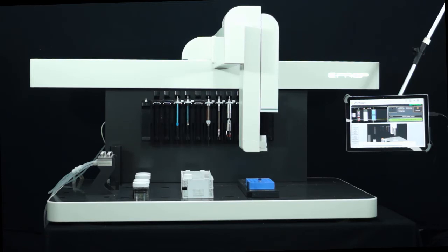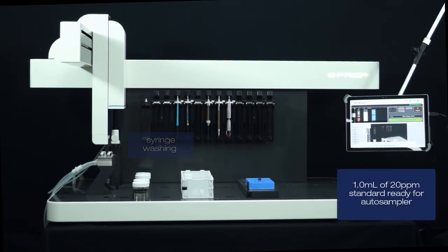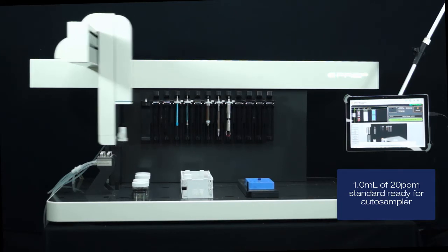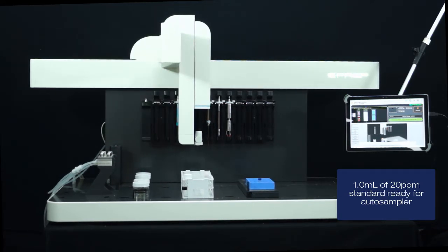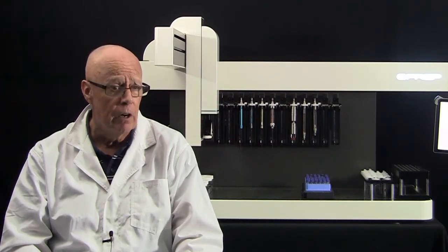The syringe can then be washed in a washing station or washed specifically with an organic solvent. The 2 ml vial is now ready to be transferred directly to the instrument's autosampler. This is a very simple workflow, but it is easily expandable to include multiple vials.